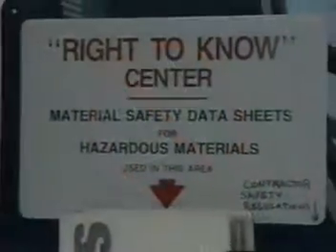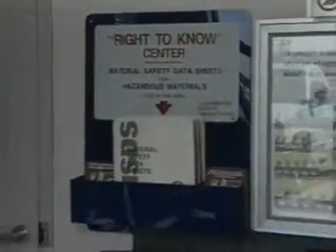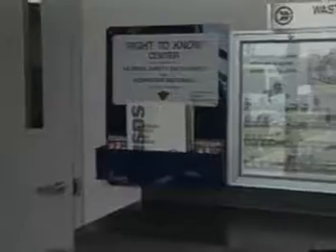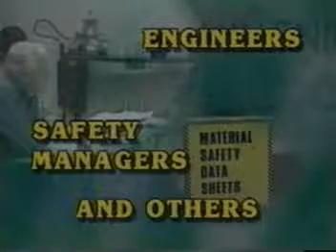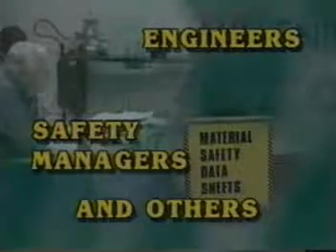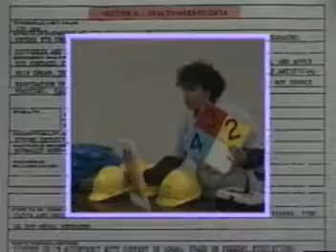To be realistic, the information on the MSDS is technical in nature, which may or may not be useful to users of the chemicals. Much of the MSDS information is used by engineers, safety managers, and others to determine the actual hazard of the chemical and develop policies and procedures for the safe use, handling, storing, and disposing of the chemical. The MSDS also provides information on what type of personal protective equipment is necessary and first aid procedures to take in case of exposure.